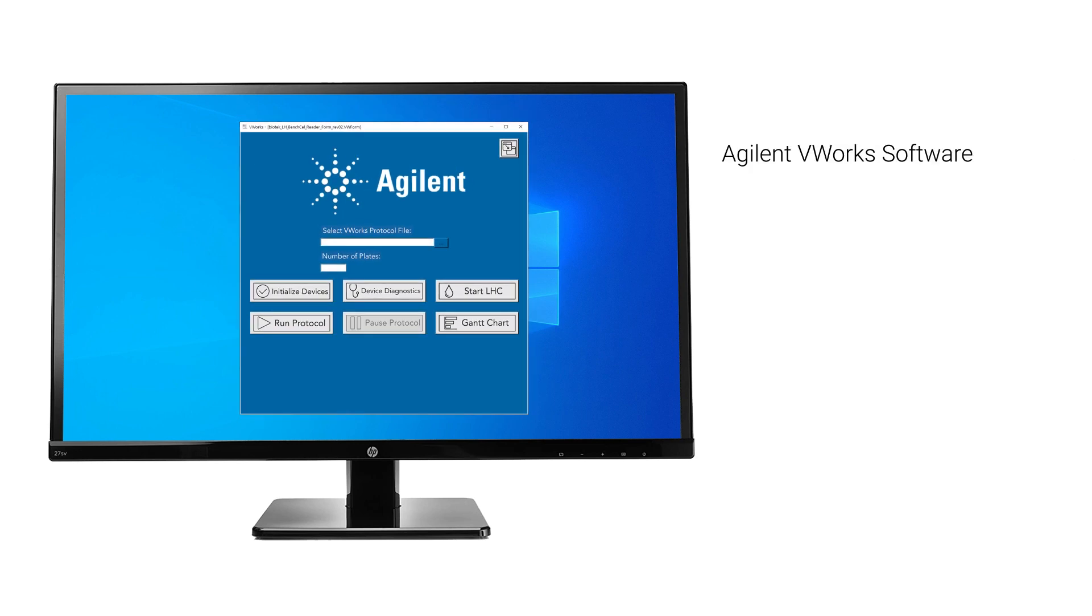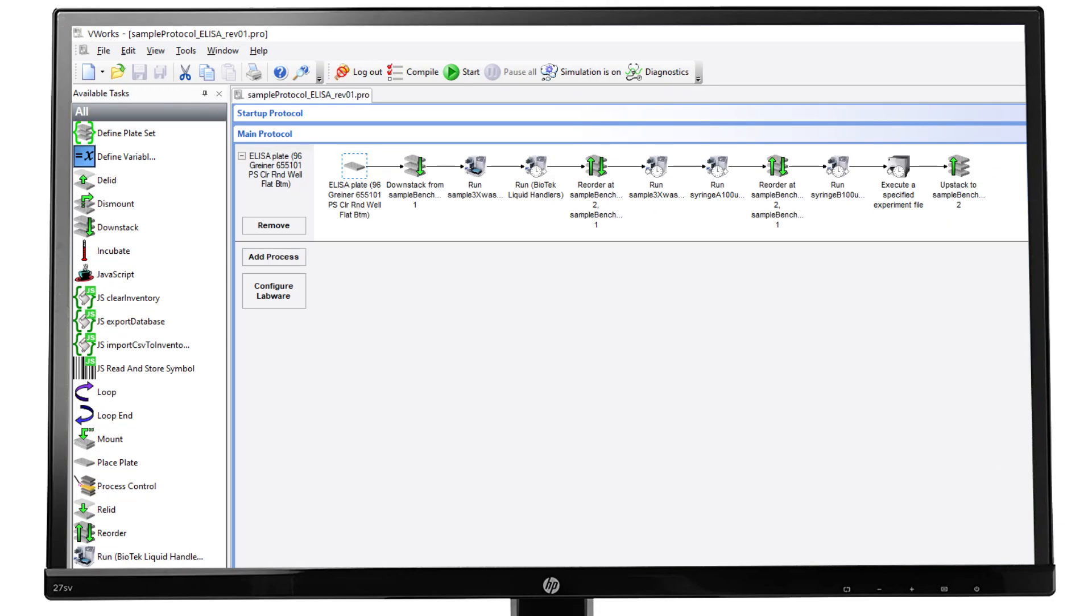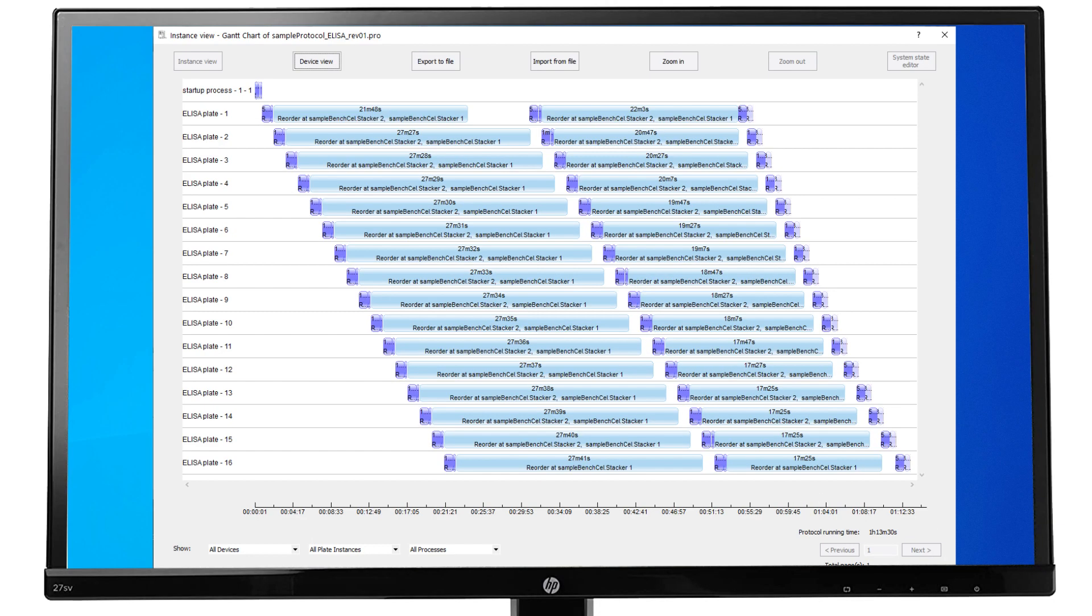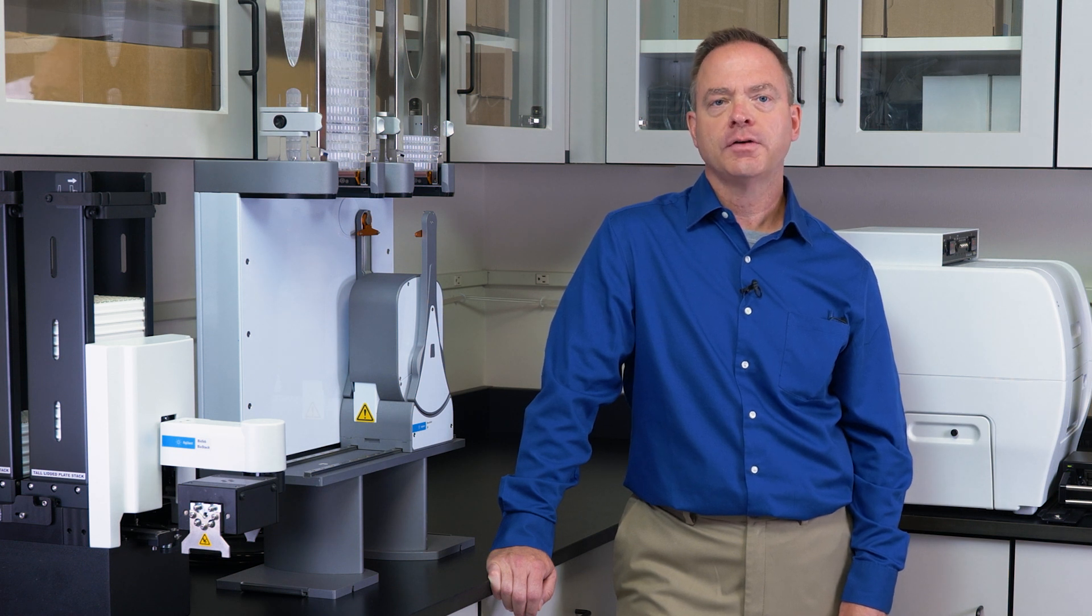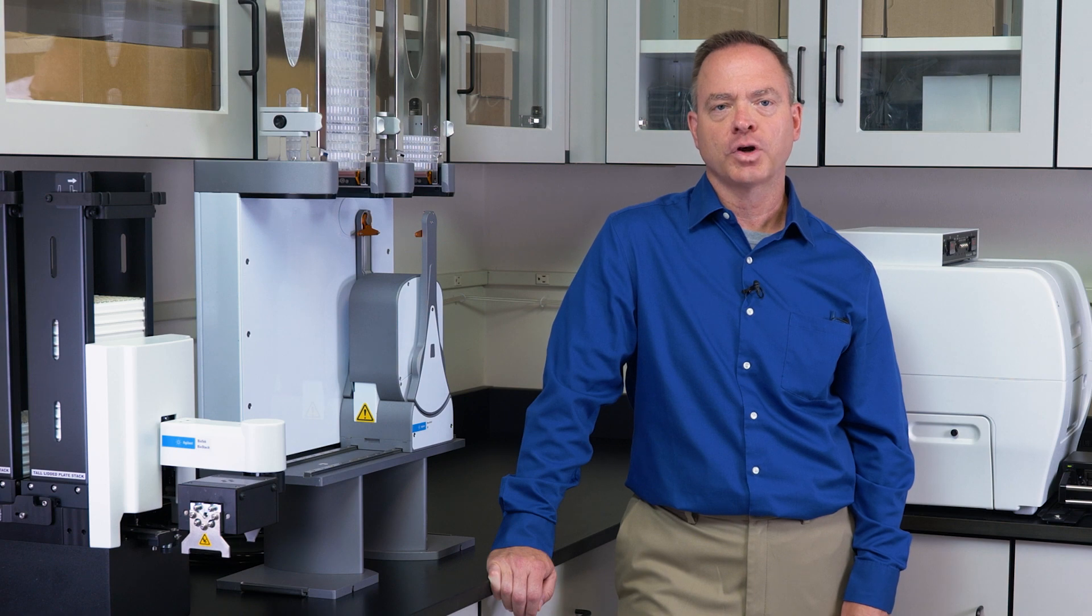The BenchCell is run using Agilent's VWork software which offers an intuitive graphical interface and dynamic scheduling capabilities that makes setting up and running a multi-step, multi-instrument protocol easy to complete. Users can create and run protocols, forms and monitor progress of their workflows from VWorks.